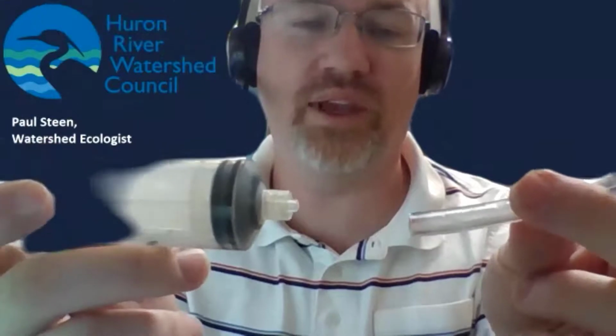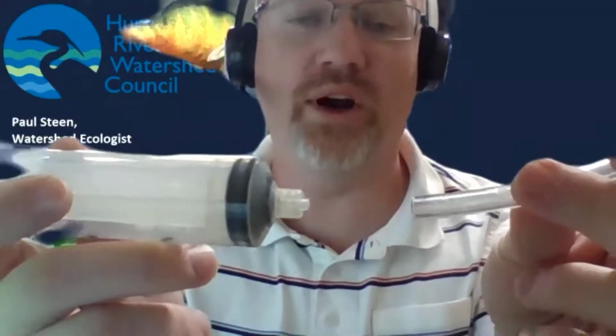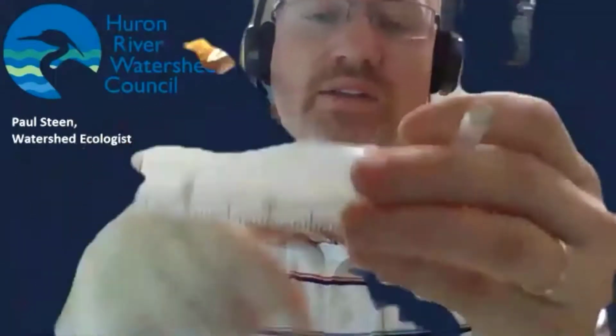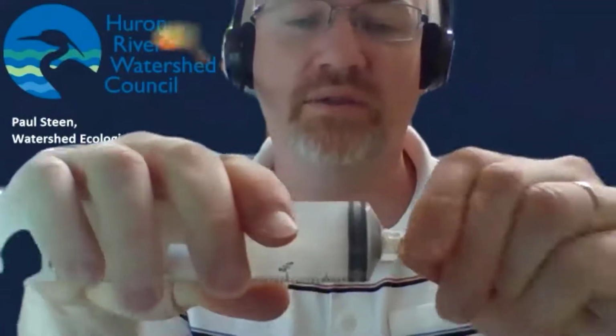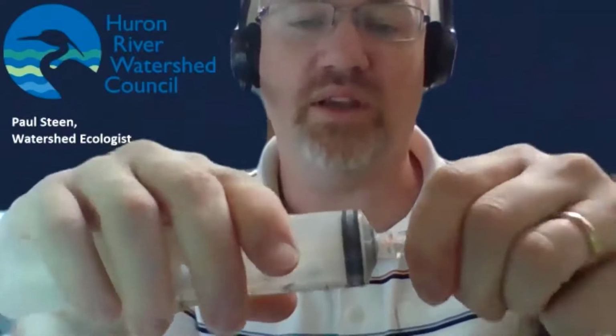That's because these two things were not necessarily designed to work together, but we make it work because all you have to do is put enough force and you can get that in there. You just have to squeeze and push and you end up with that. And that's actually how you're going to draw up your water.